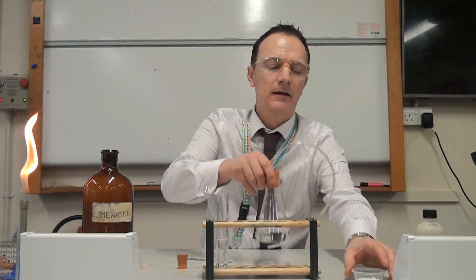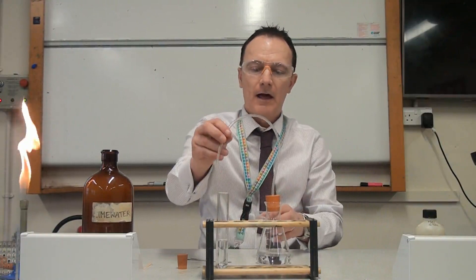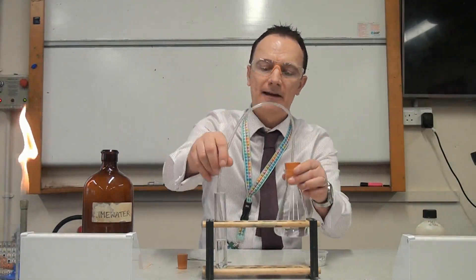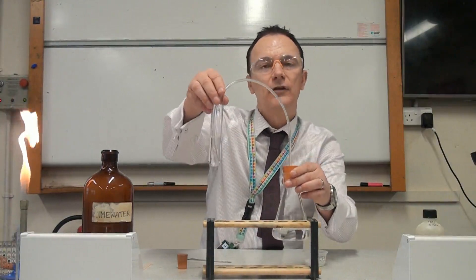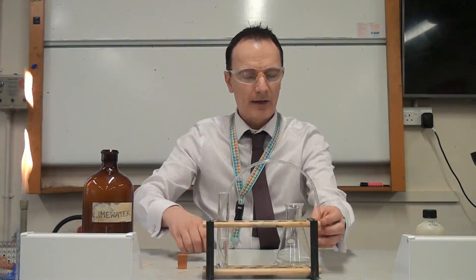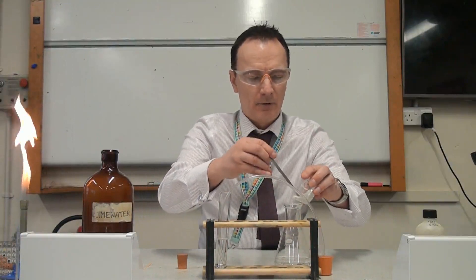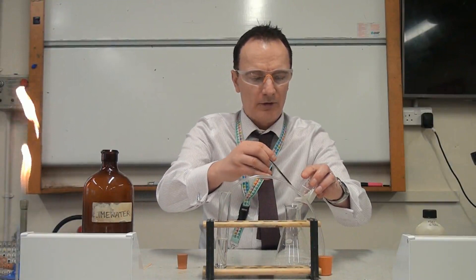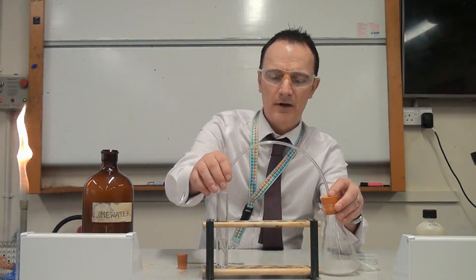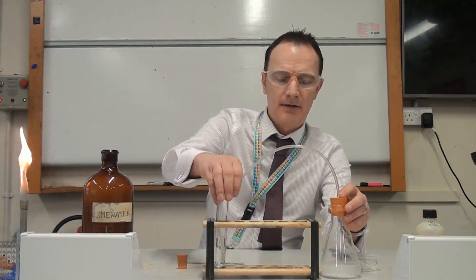I've got my hydrochloric acid, and the carbonate I'm using is calcium carbonate. I've got a delivery tube coming from the flask going into this tube of lime water. When I start to put the calcium carbonate in, we will start to see bubbles of carbon dioxide gas coming through the lime water — there it goes.